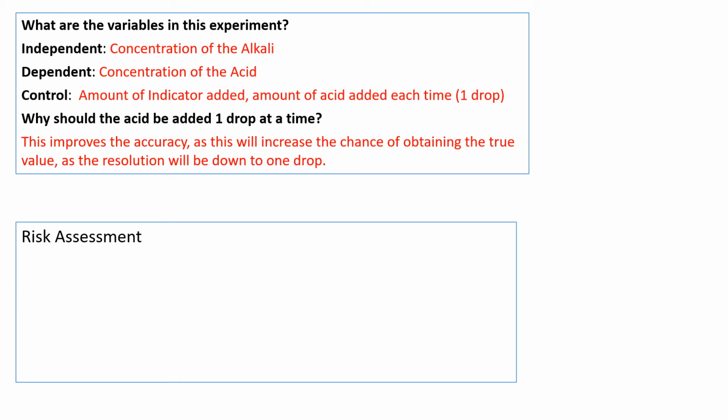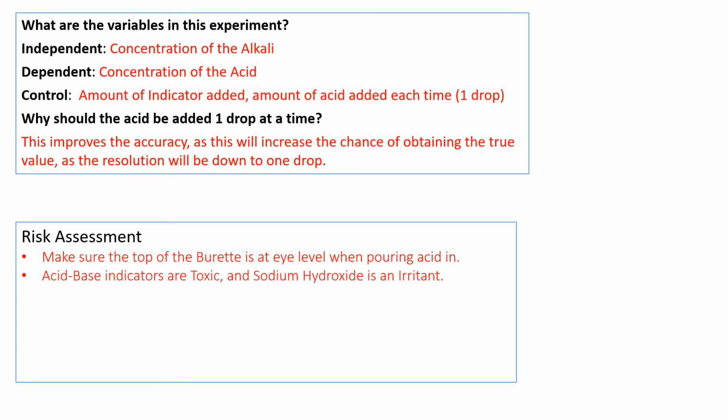So, risk assessment. We're using acids and alkalis, so think about this. Make sure the top of the burette is at eye level when pouring the acid. The acid-base indicators are toxic, and sodium hydroxide is an irritant, so no bathing in it, guys, or drinking it. Care should be taken with them both.